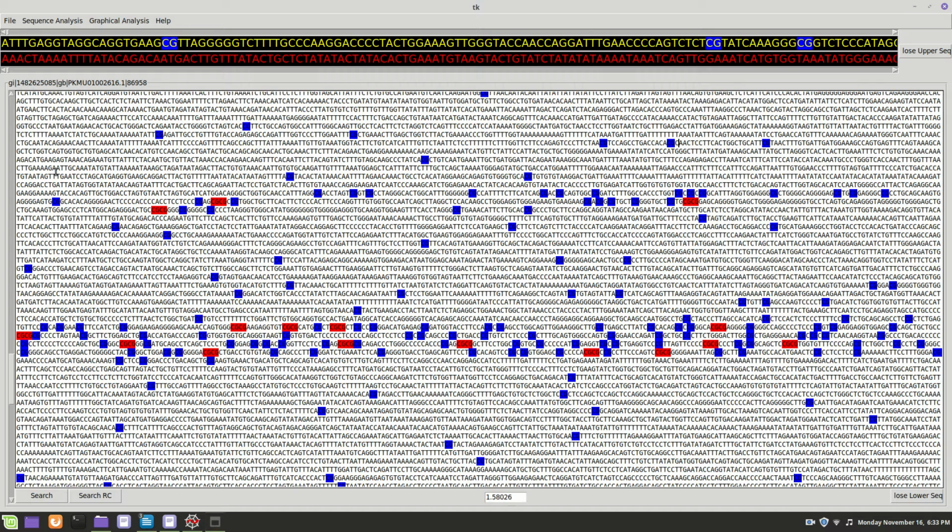So for gene 4, I started here, and I went backwards 1,000. All right, so down here, if you notice, I have a number. Wherever I'm blinking, wherever the cursor is, that's where I'm at. I'm at 66, almost 67,000, so I need to be at about 66,000. So I go back up here, and I'm at 58, so I'm pretty sure that's not right. 59, no, 66, so about 69, so that should be at 65,000, somewhere in there.